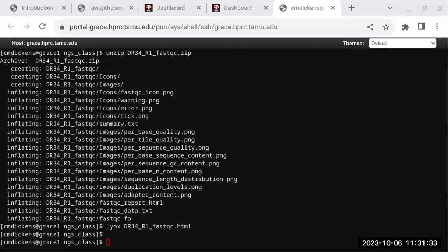And so this is still part of your genome, but it just so happens that it selects the same motif where it cleaves the fragment. So that's why you see this in the front here. So if you see something like that, talk to the sequencing center and ask them about it.